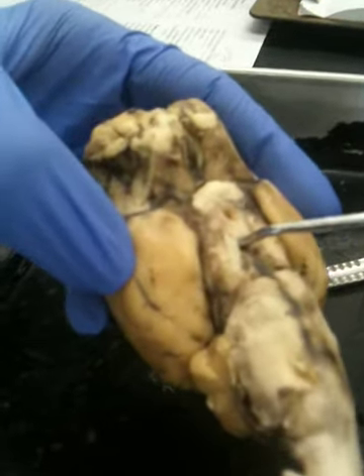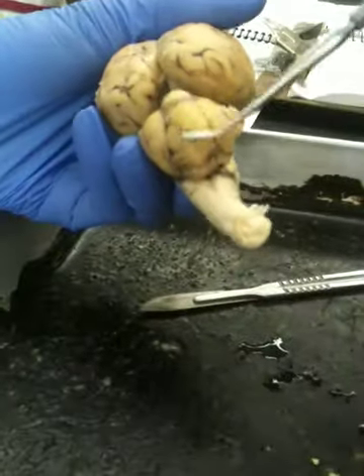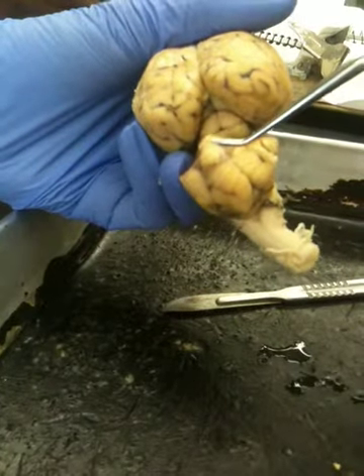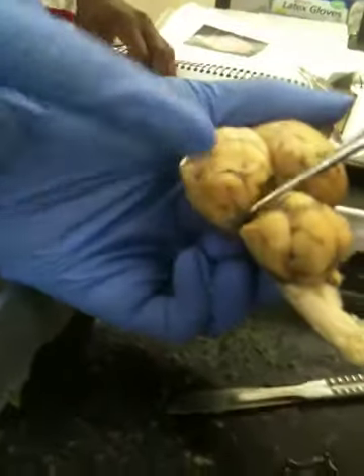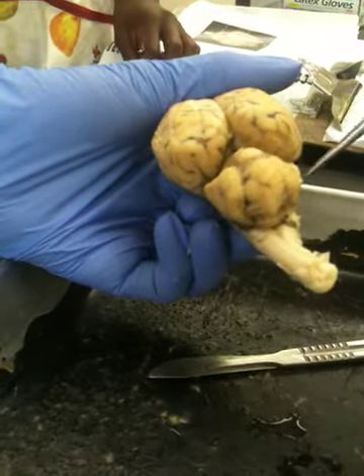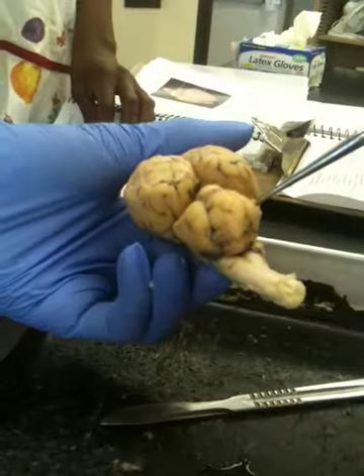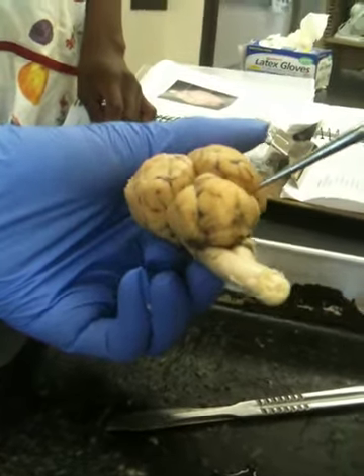Okay. The cerebellum, often described as a little nugget hanging right from the end of the brain. It has a transverse fissure that separates the cerebellum from the cerebrum, as well as the cerebellar hemispheres, which would be these two lobes on either side. The arbor vitae we will see in just a moment when we cut this brain right in half.